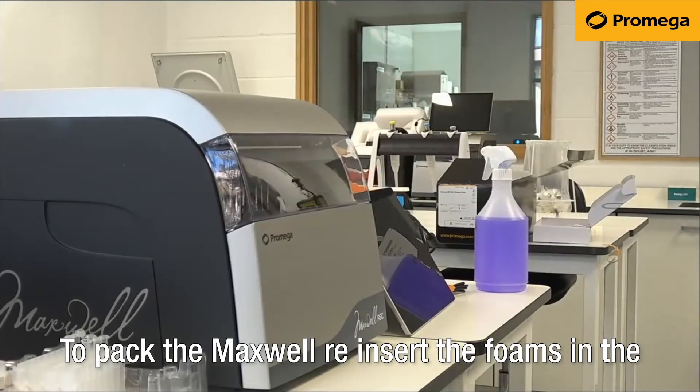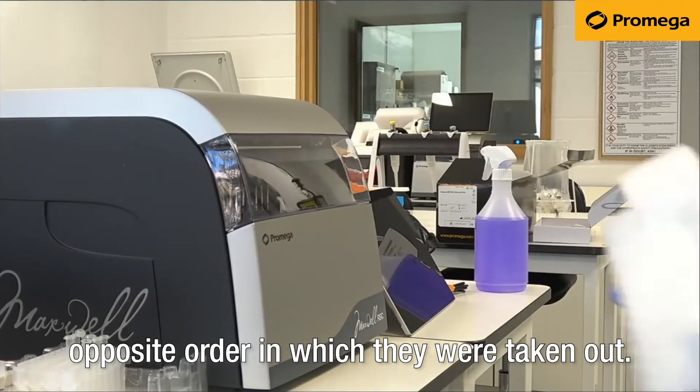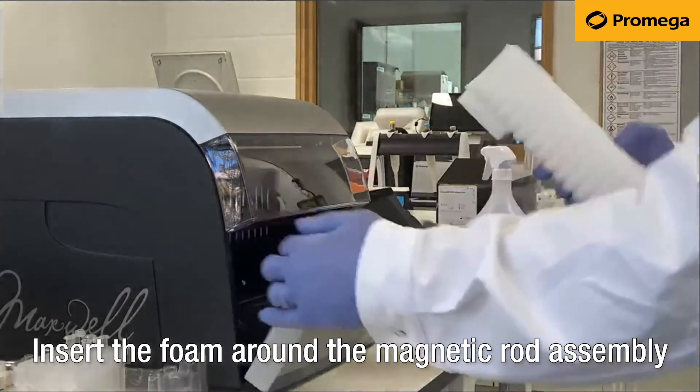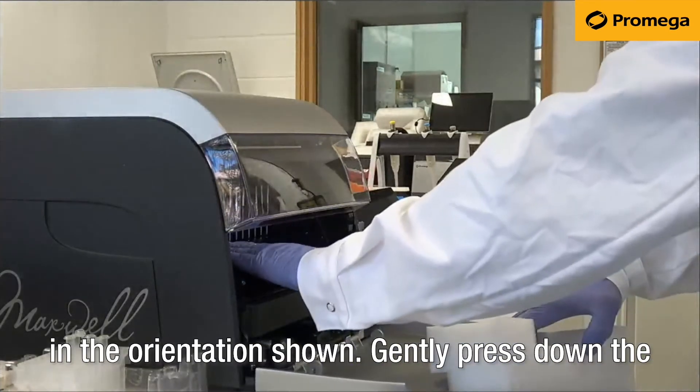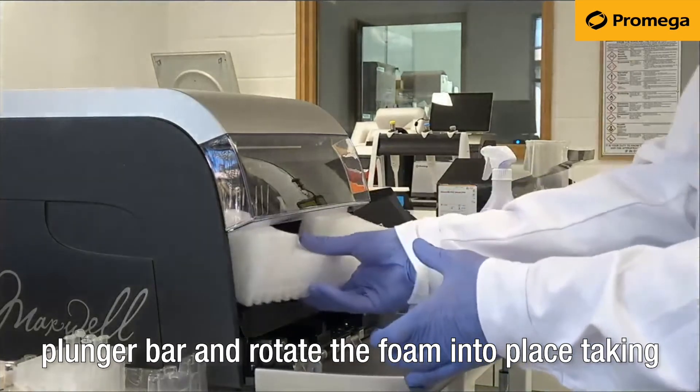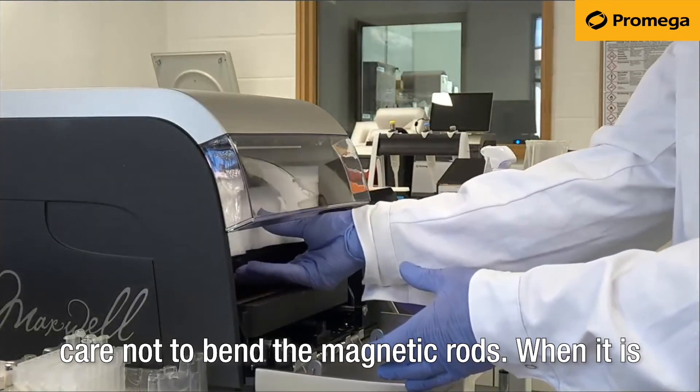To pack the Maxwell, reinsert the foams in the opposite order in which they were taken out. Insert the foam around the magnetic rod assembly in the orientation shown. Gently press down the plunger bar and rotate the foam into place, taking care not to bend the magnetic rods.